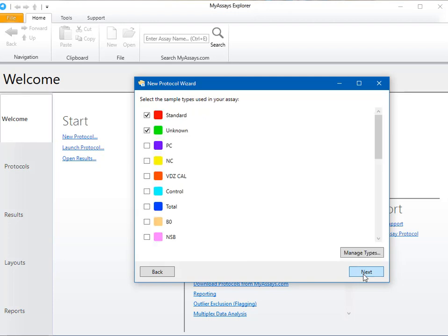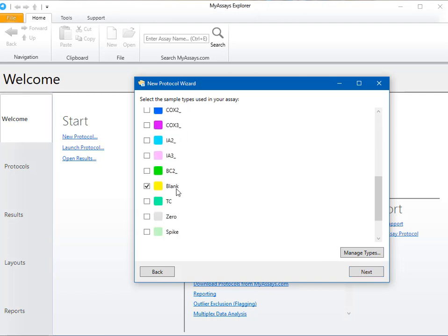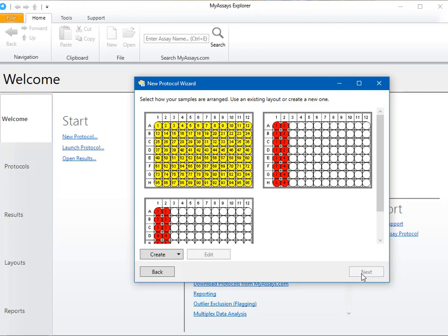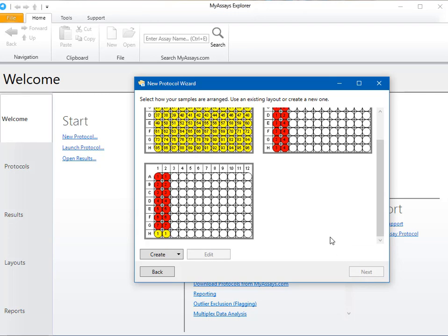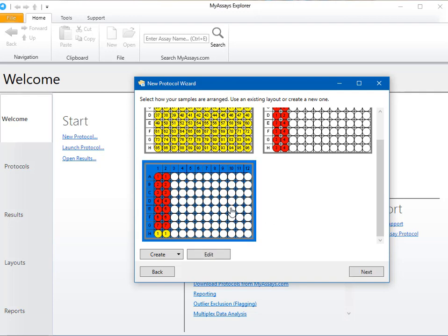Now I'll select the sample types used in my assay, which are standard and blank. And on the next step, I'll select my plate layout. You can choose from one of these existing layouts, edit a layout, or create a new one. If you select to edit or create a layout, the Plate Layout Editor will open. For more information on how to use the Plate Layout Editor, please see the associated video.